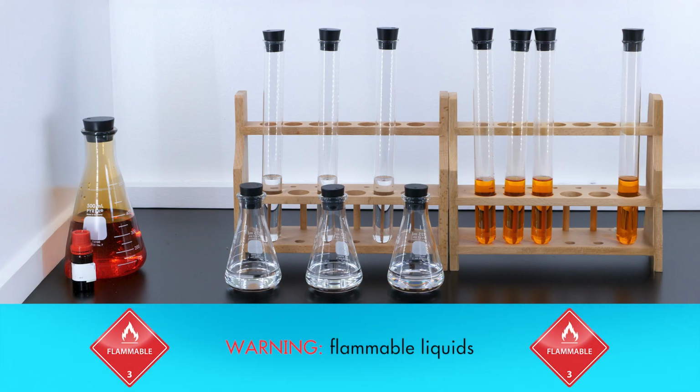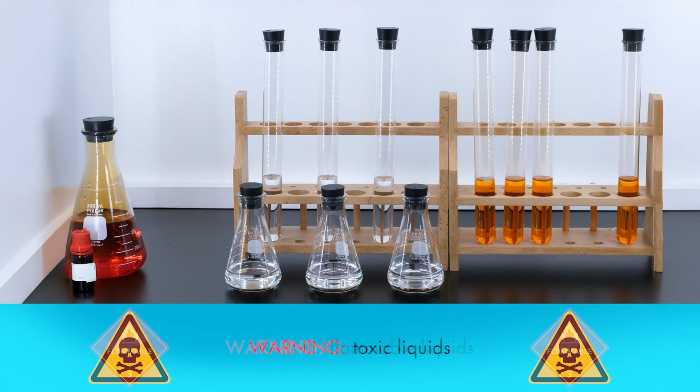In addition to being volatile, these hydrocarbons are flammable, so even their vapors could easily catch fire. One additional warning: all 3 of these liquids are toxic and could cause health problems after prolonged exposure. Because of these potential hazards, we will perform this experiment under the fume hood.